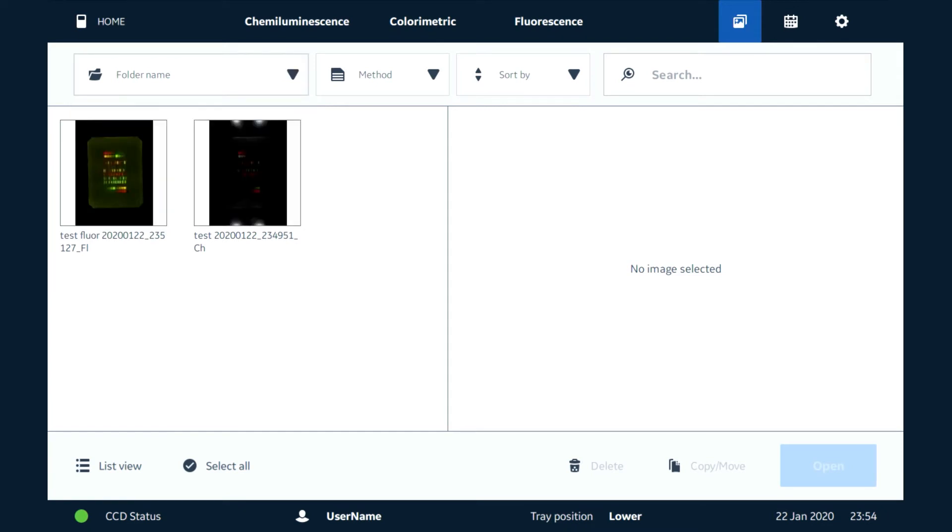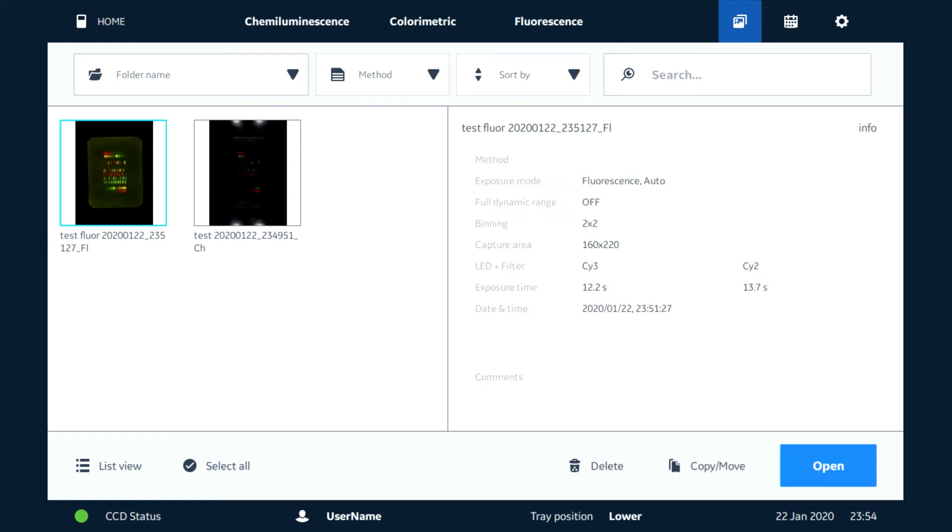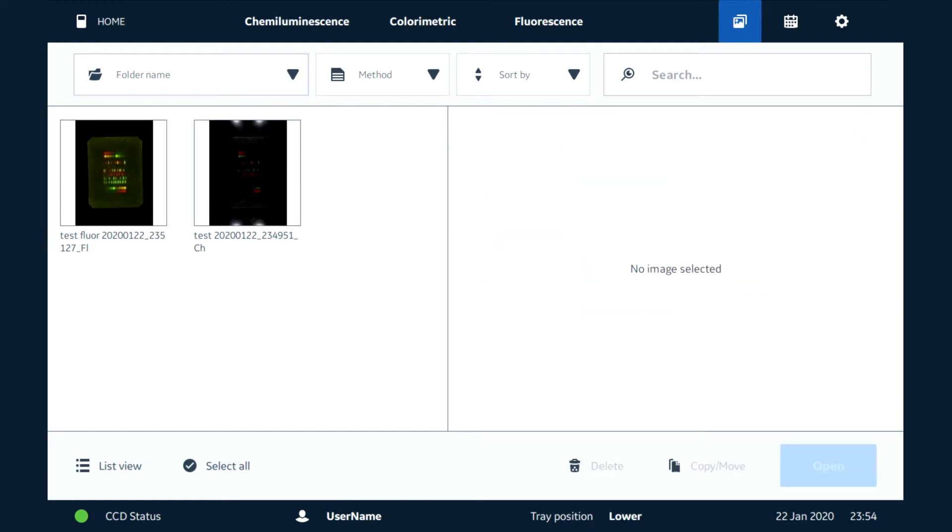Once you get to the destination folder, you'll see a nice little thumbnail here. It'll preview the image. We can click on that. That's going to give us more information about how the image capture was performed. We can then open that up.